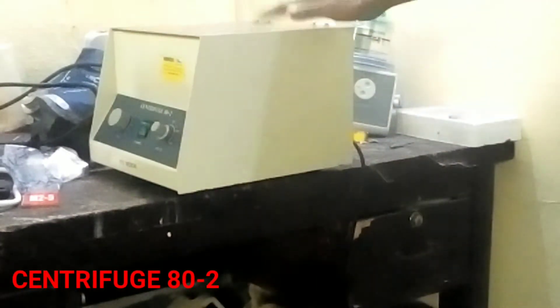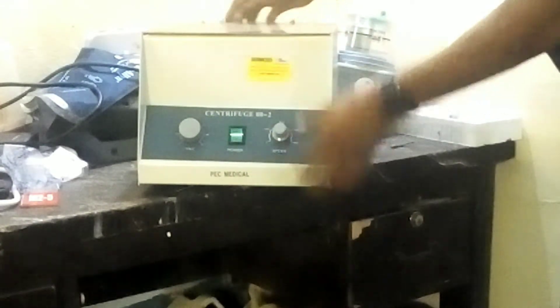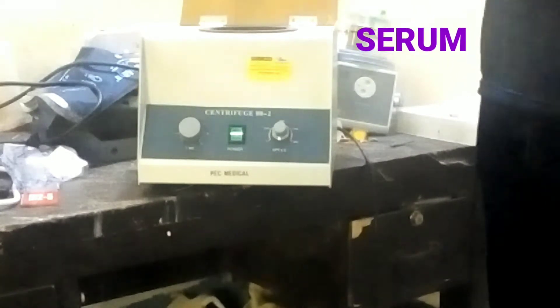Hello, good morning, my lovely viewers. Welcome once again to Dan Biomedical. Today I'm going to take us through troubleshooting and repair of a centrifuge. As you can see here, this is a centrifuge machine for the laboratory — centrifuge 80.2. It is used mainly in the laboratory to spin blood samples. Whenever lab samples have been taken from the patient to carry out a diagnosis test, you put the blood sample into this container, fit it back in, and then this machine spins the blood samples to separate the serum from the blood so that it can be used for special diagnosis.